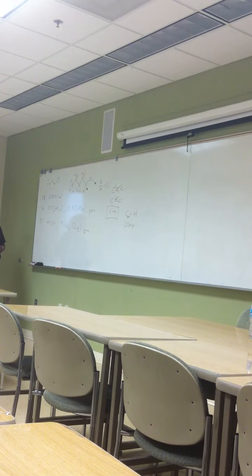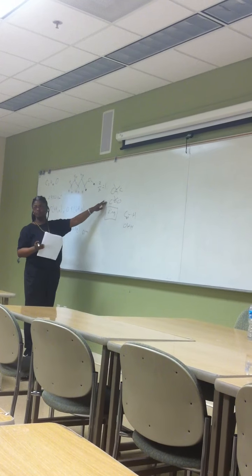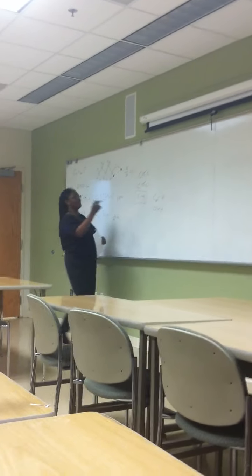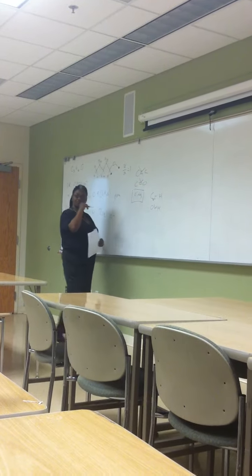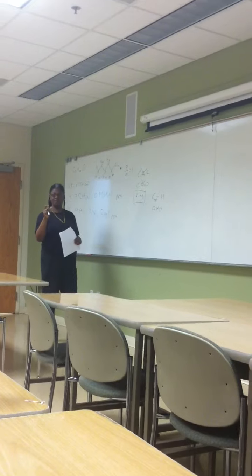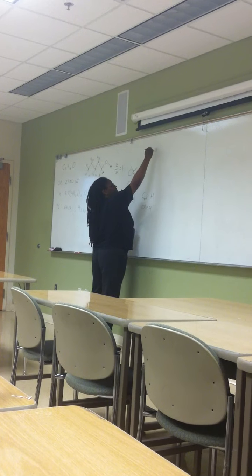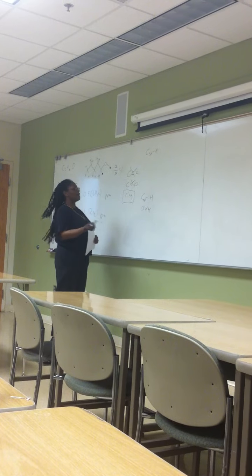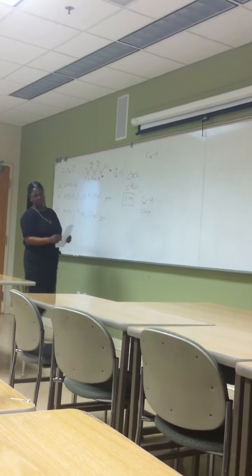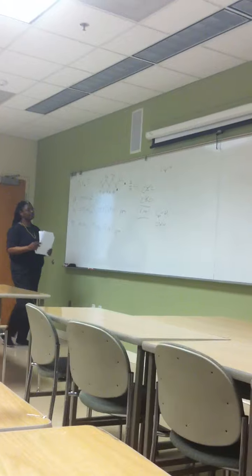Excuse me, just to solidify my thinking, we eliminated the double bonded carbons and the carbon-oxygen simply because the IR did not show them, right? Mm-hmm. Yeah. And you also don't have any, these would be strong stretches too. Carbon-carbon triple bonds are variable, so sometimes you may not see them. So if you don't see that, you would look for an sp hydrogen stretch too. Or even for this one, you could look for an sp2 hybridized carbon-hydrogen stretch as extra confirmation that you don't have those too.